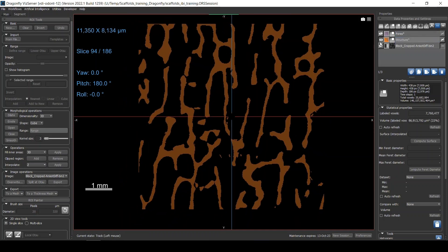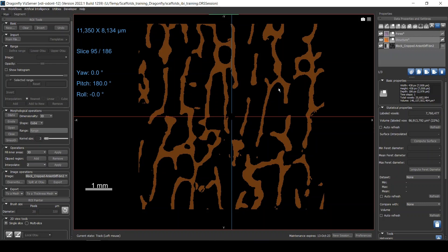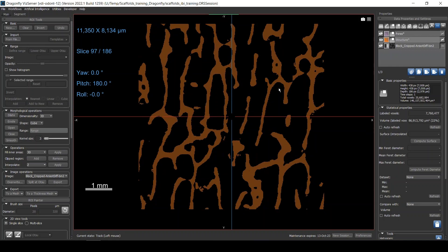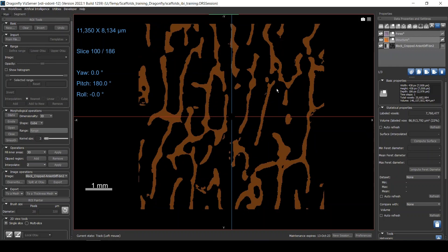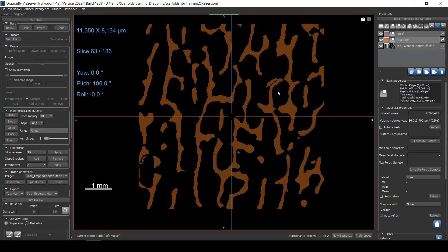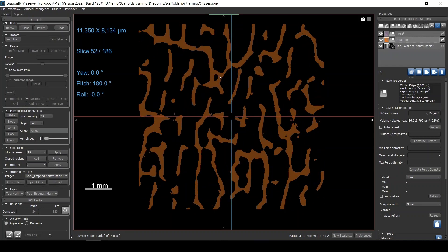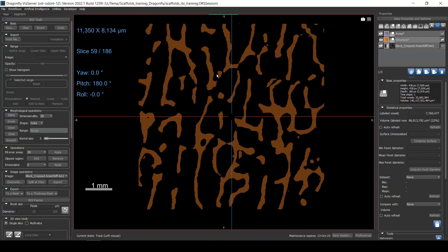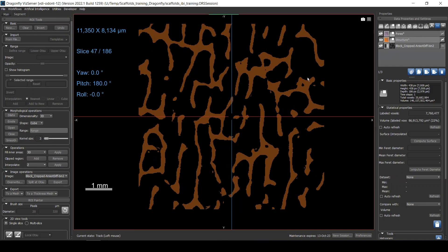The first thing I'm going to check is whether there is any inaccessible or closed pore. If there is a closed pore it will definitely not be accessible to any cell or medium. We can't really tell just by looking at the slices because we have to consider a 3D object — something that looks closed in 2D may be open somewhere else in 3D.